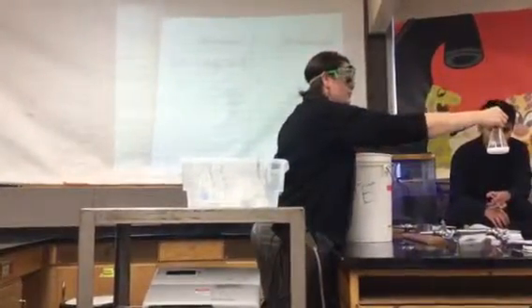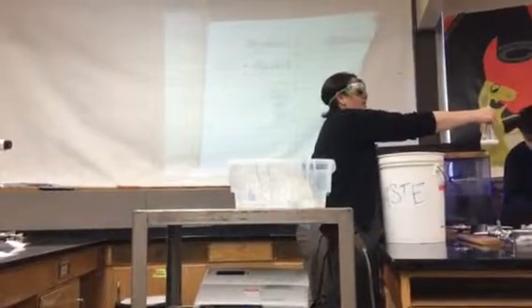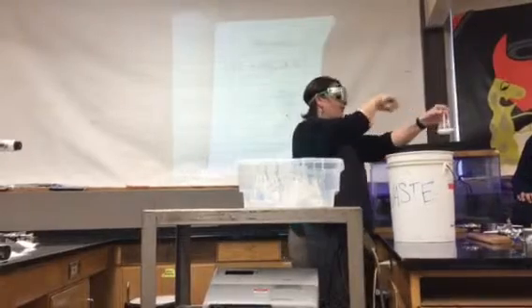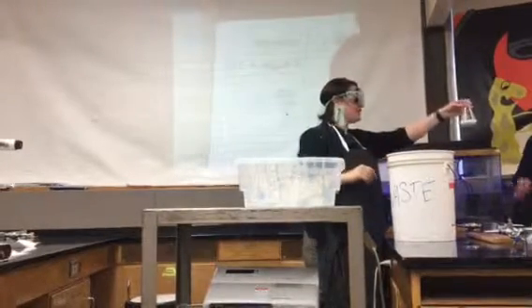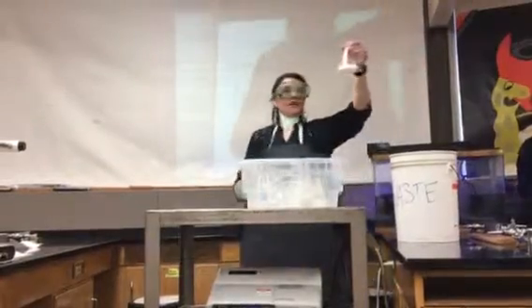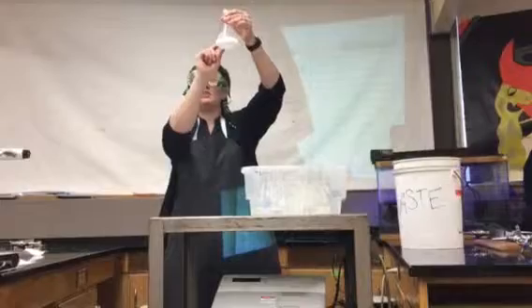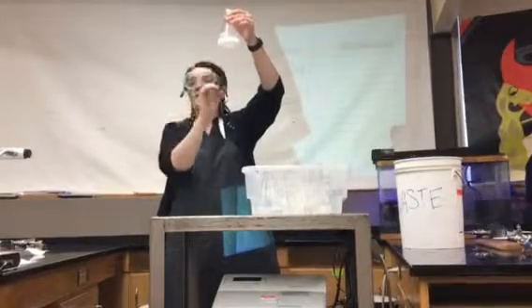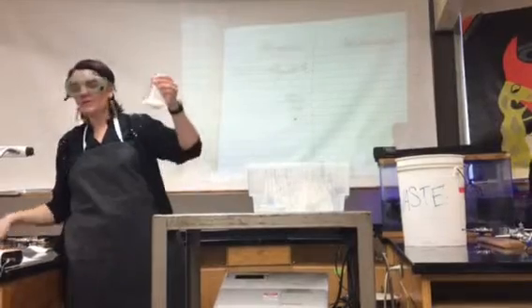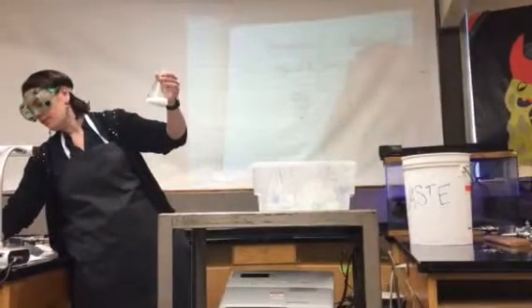Can you grab the solid? If you could filter it out, if you grabbed it with your hands, it would feel like snot. But if you poured it through a coffee filter, it would filter out. Well, we're not going to touch it because there's other things in there. So can you see it? When I hold it up to the light, I can see it really well. There's like a stripe, and the heavier stuff is sinking. Okay, so what was this called again? Precipitation.